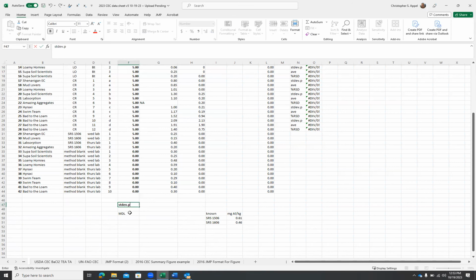Why was hydrogen not correct? Good question, because that first titration measures all the exchangeable acidity, right? And the second one measures aluminum. And then the difference between those two is hydrogen, right? So let's see here. We have here titration for hydrogen and aluminum, titration for total acidity. And what I'm going to do right here is, in my caption above the table where it says titration for hydrogen and aluminum, I'm going to just put EA, exchangeable acidity, so I know what that means in my table.